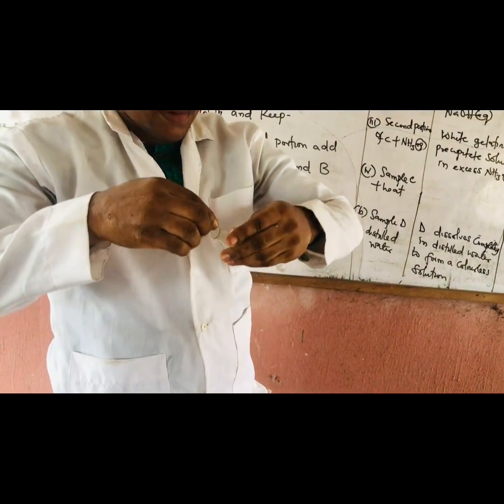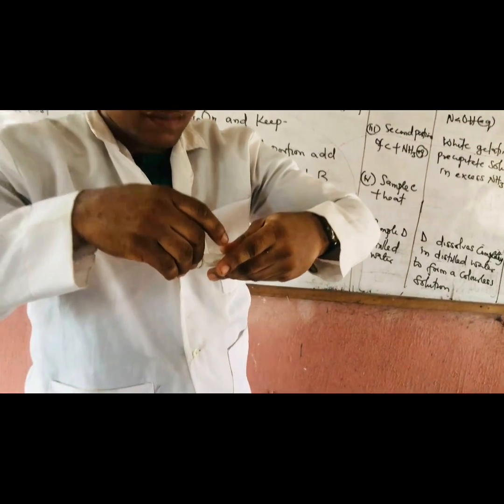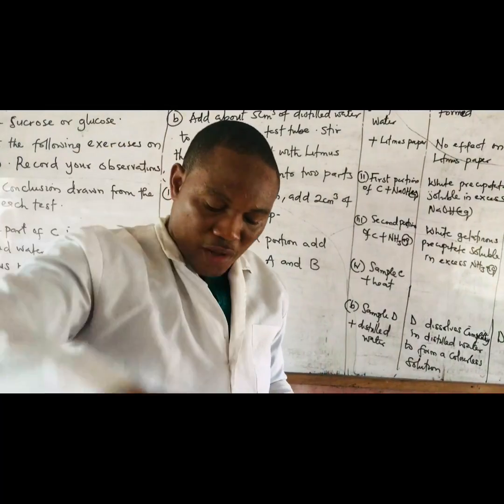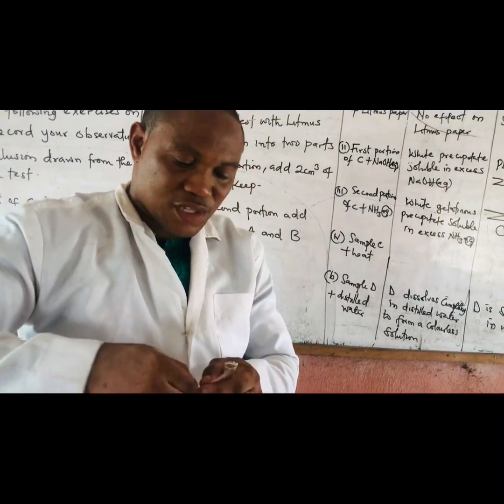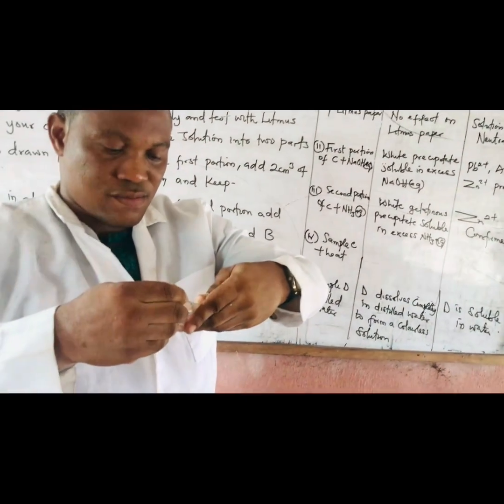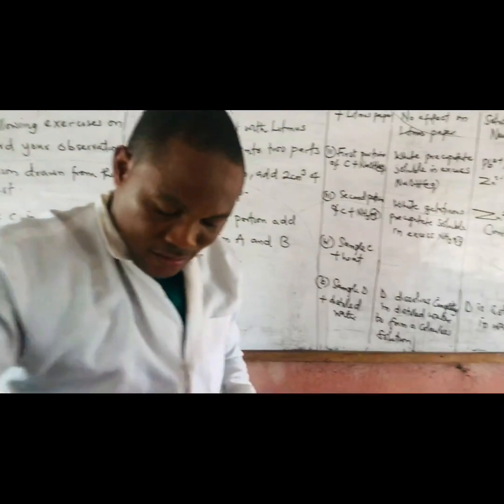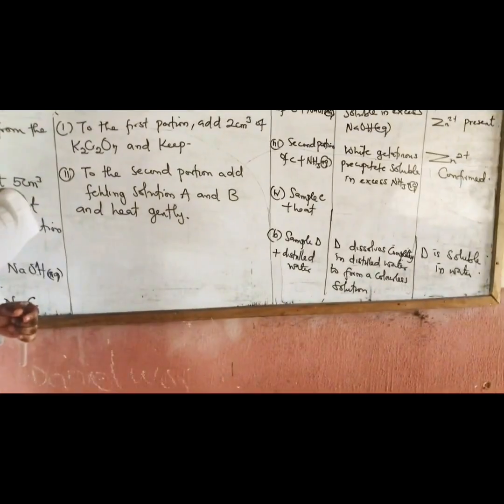Let's test with blue. You can see, no effect. Let's test with red. You can see, no effect. So even from the one I did, you should understand.